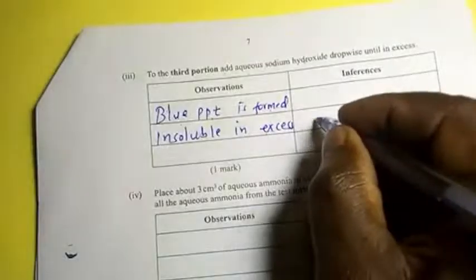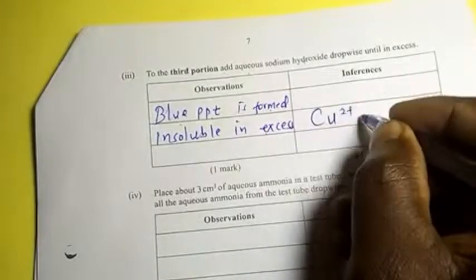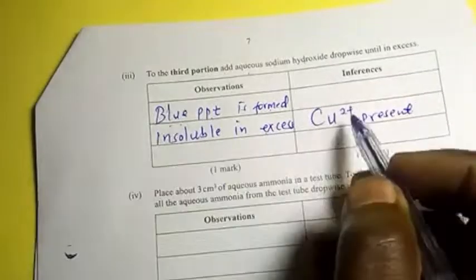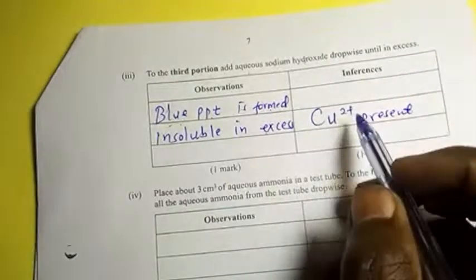Therefore, that also tells you that the copper 2 ions are present. So long as it is a blue precipitate, it confirms copper. Copper 2 ions are the only ions which are blue in color.